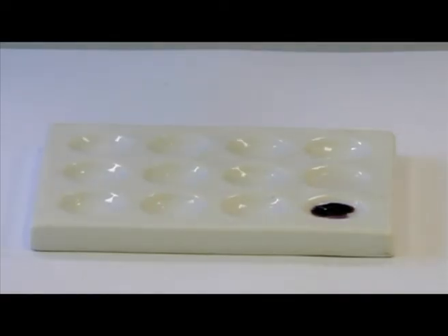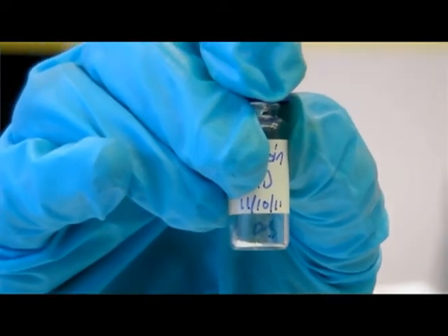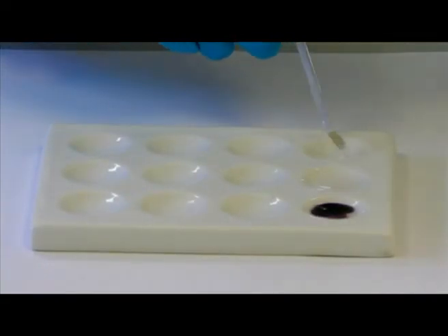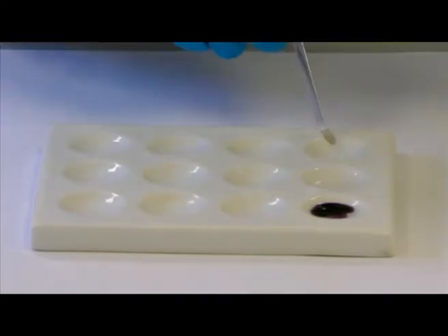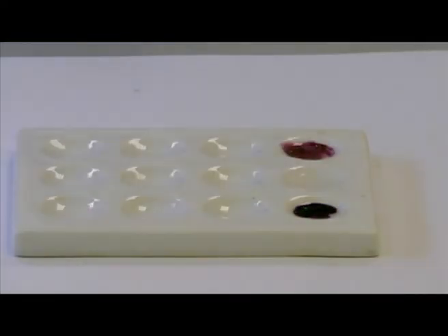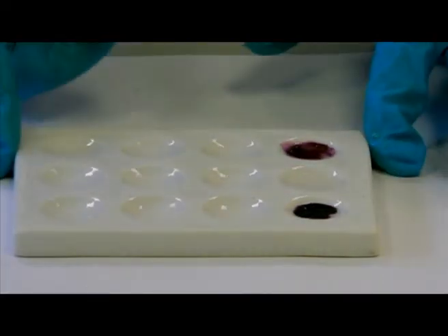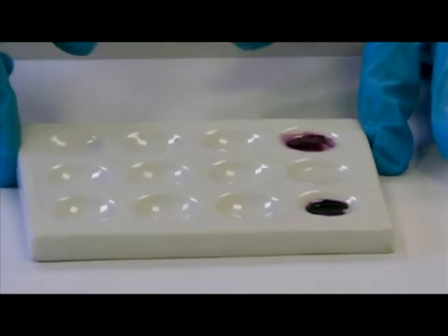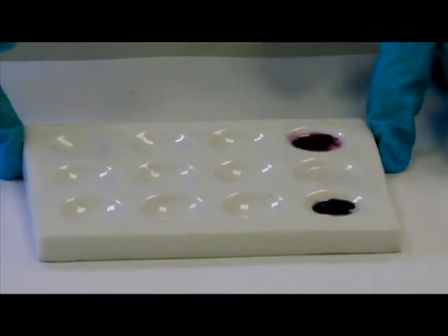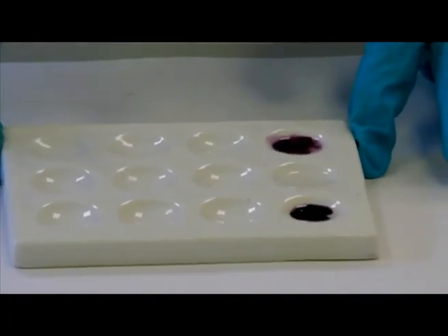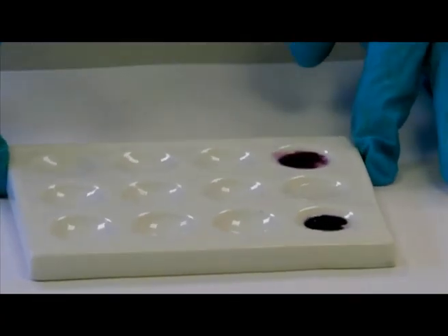Now I'm going to put the heroin standard into the well of the spot plate. So as you can see, both of our standards and unknown have gone purple, so this indicates to us that there is heroin in our unknown sample.